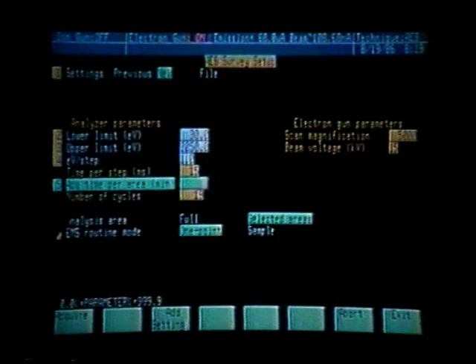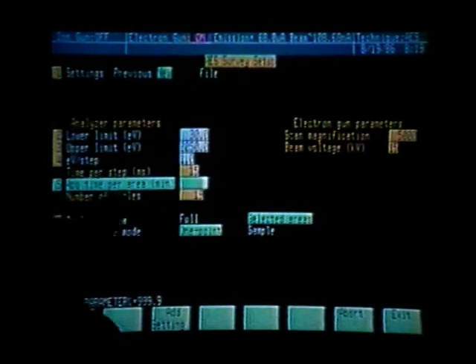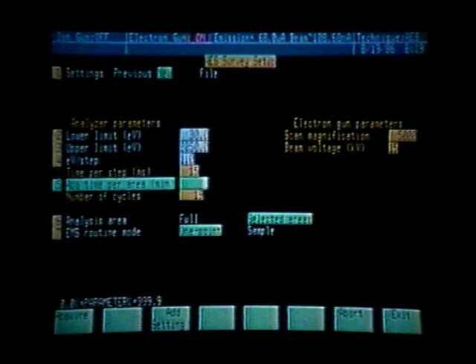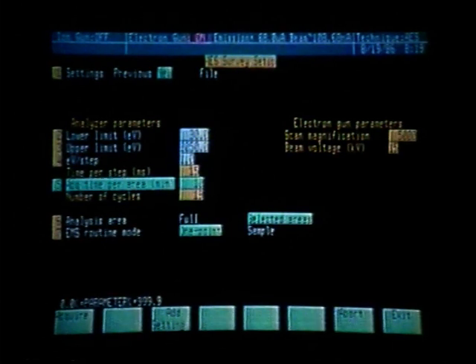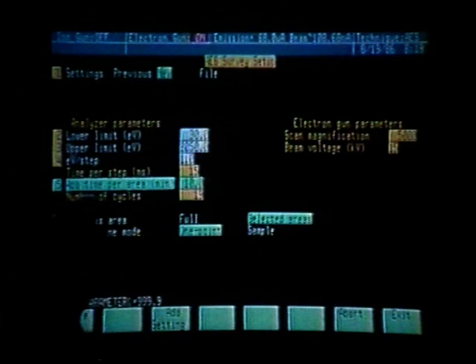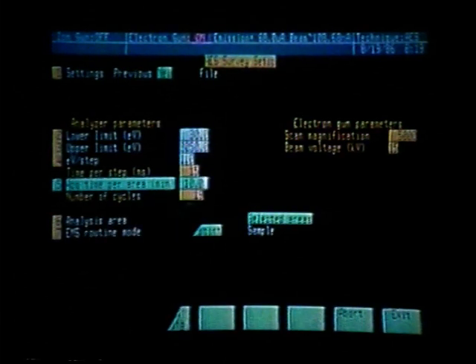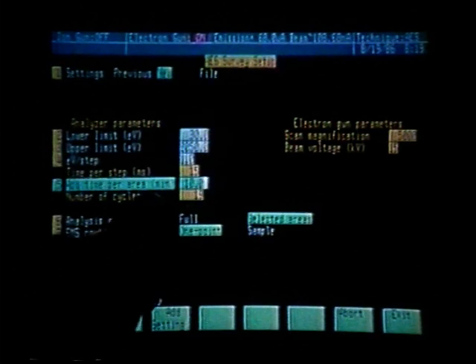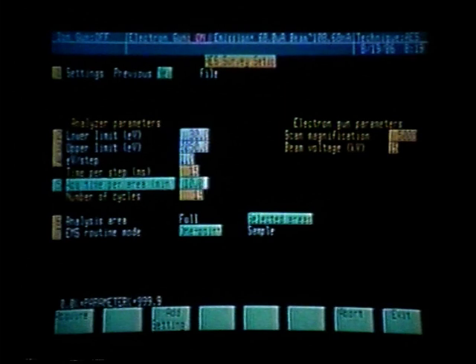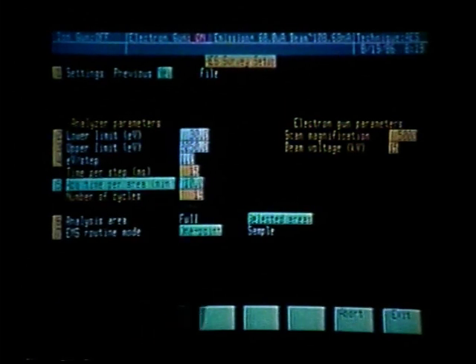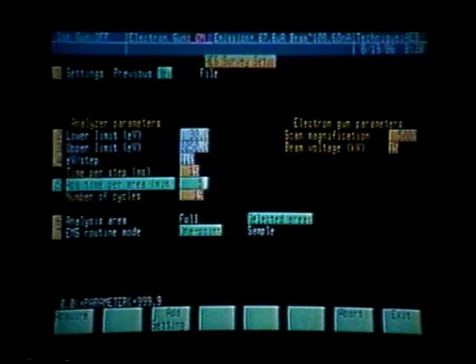Line number 5 asks how much acquisition time we wish to spend per area in minutes. We are looking at three areas, so if we spend 10 minutes per area, it will take a total data acquisition time of 30 minutes. Notice that when we type in the time per area, it automatically calculates the number of cycles — 10 minutes gives 19 cycles. If we change that to 5 minutes, it updates to 9 cycles. We wish to spend 10 minutes per area, which is a total of 19 cycles.